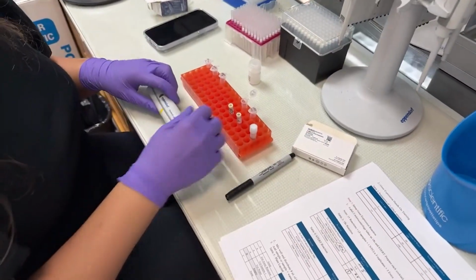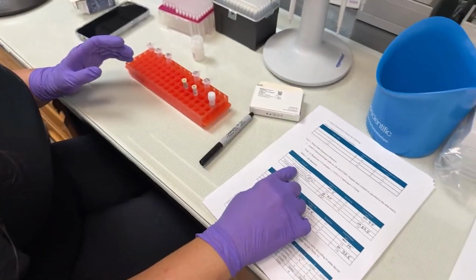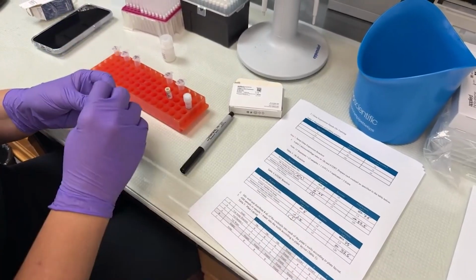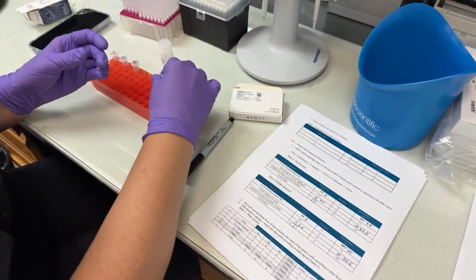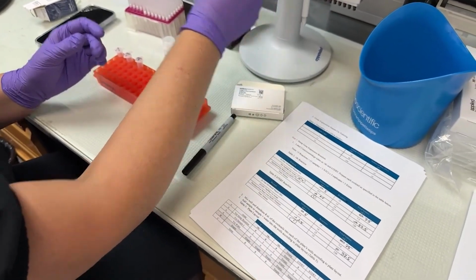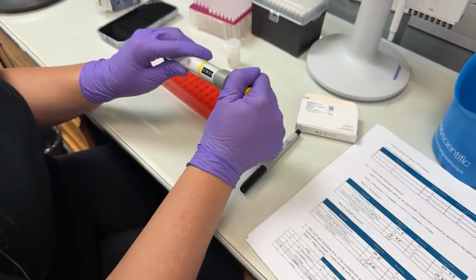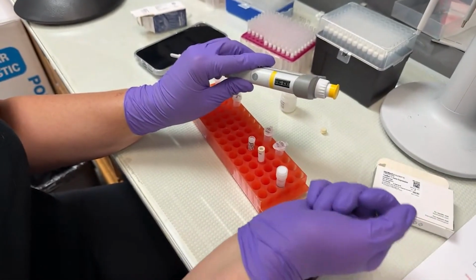All right, so that was our first component. We will move next to our assay mix, which includes primer and probe. That's everything that's in here. This is for our 18S reaction. Take off the lid, and I'm going to dial up 7.5 microliters. So now I need the 10 microliter pipette that I'm going to dial up for 7.5 microliters.